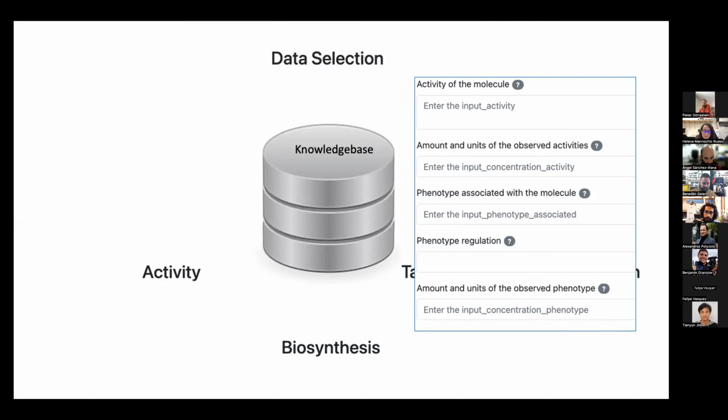Caroline said it's heavy, I think, there's a couple of questions. Is this heavy on microbe hosts, or is it this where other microbes, cyanobacteria, will also end up? It can be any microbial source. So if you're doing drug discovery from natural sources, it's fine to add those activities here as well, because it can actually help.